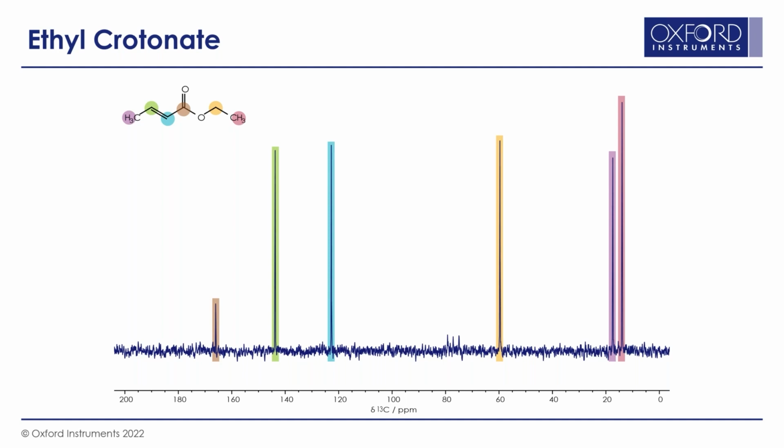This isn't implying that carbon-13 spectra can't be quantitative. However, the proton decoupled one-dimensional carbon-13 NMR experiment, as usually performed, isn't. It should be noted that the ester carbon with no directly bound hydrogen atoms, in brown, gives a clearly less intense signal than the other 5 carbons, which have bound hydrogen atoms.